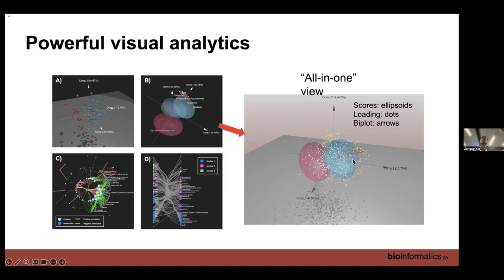And here you can actually see more things: how these things separated, where they're located. We put all of them together. They call it a biplot. So this is similar to PCA. It's just multi-omics, with more advanced matrix manipulations. And here we show the correlation networks, how they are correlated once you identify some features.